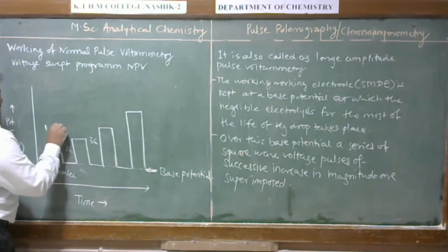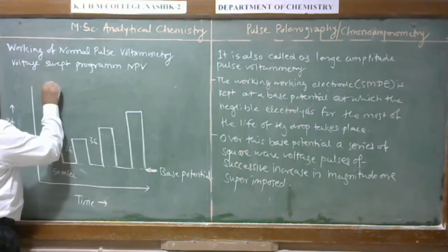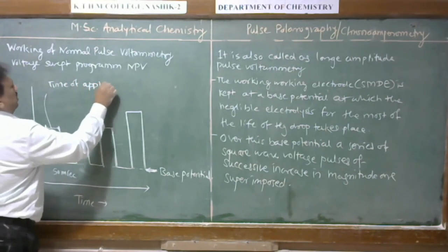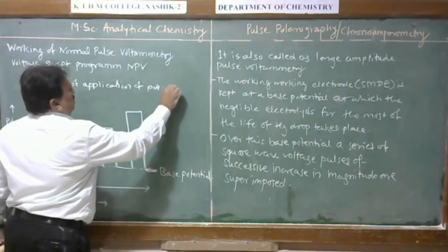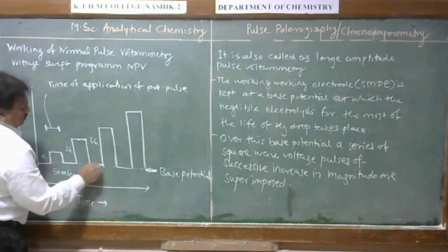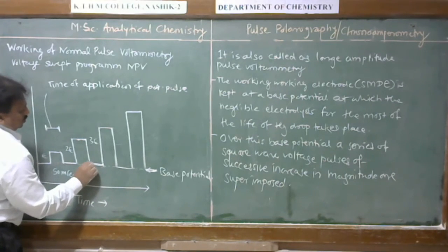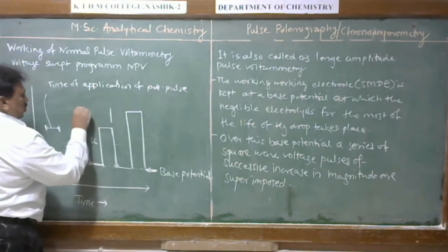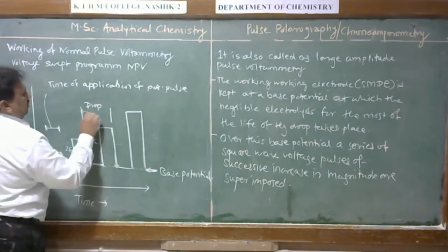That is a here, we may say the time of application of potential pulse. Here, from this point to this point, this is a drop time.